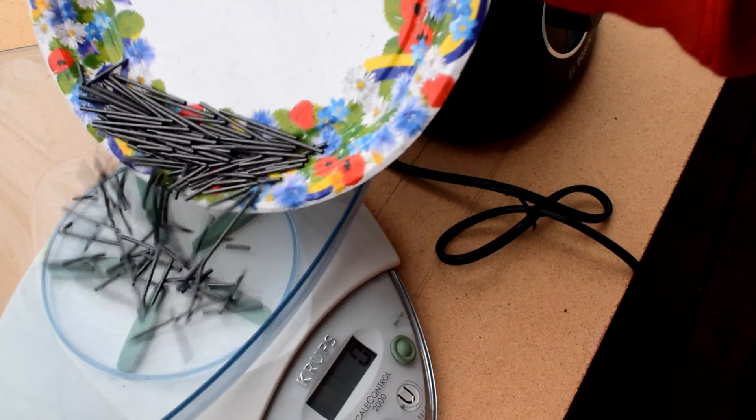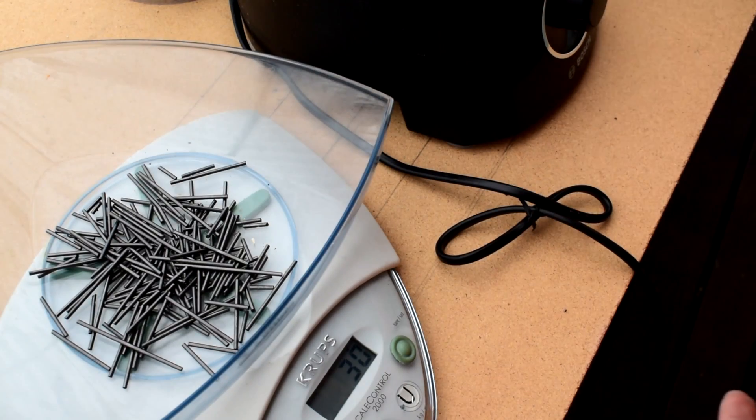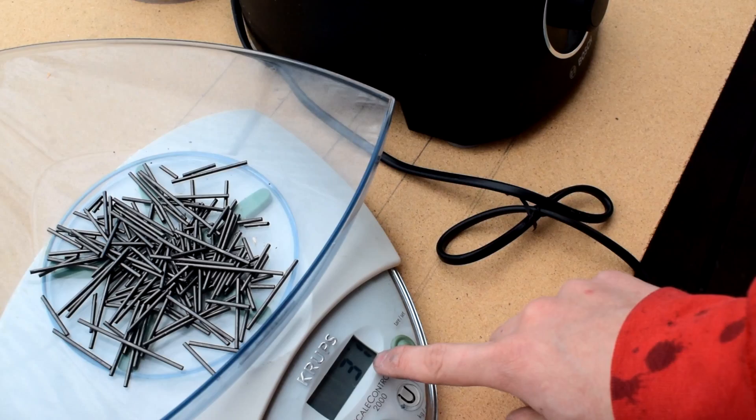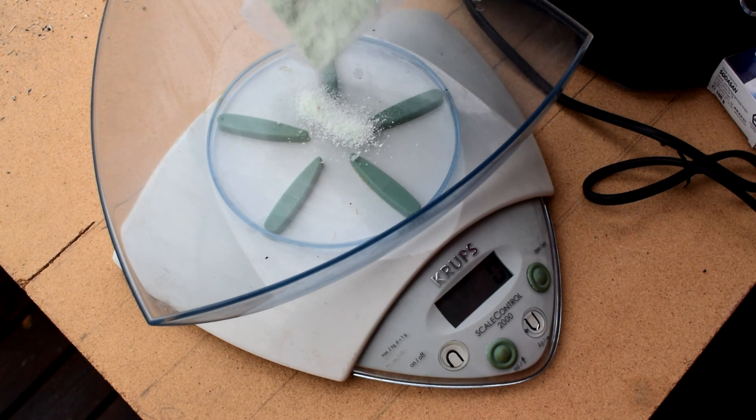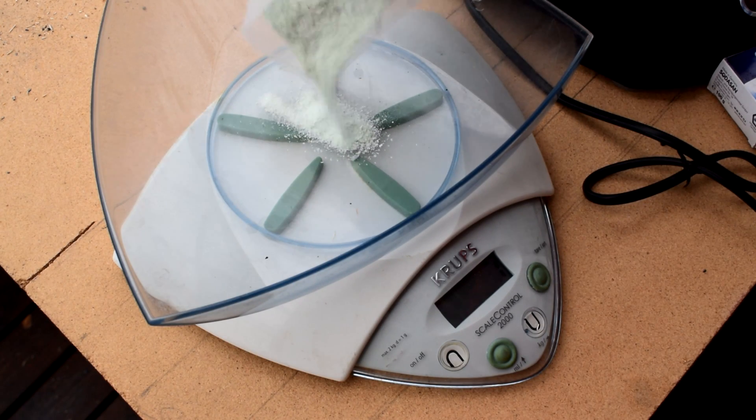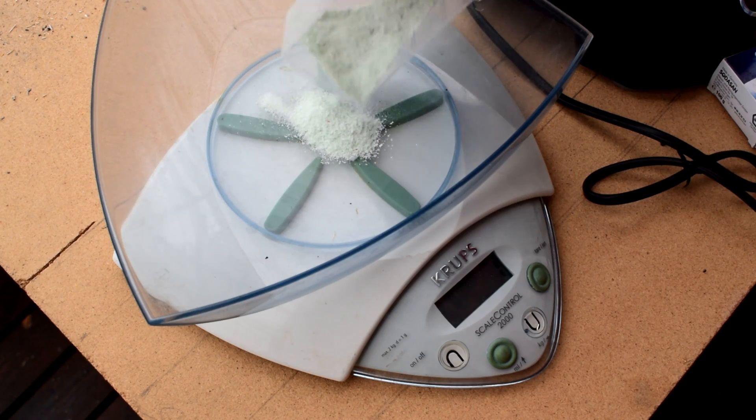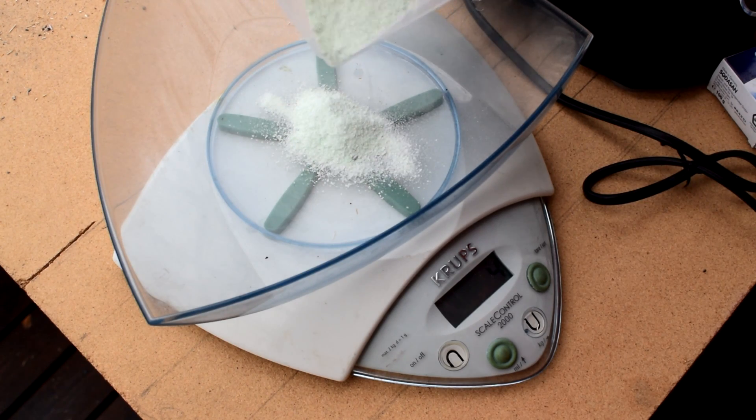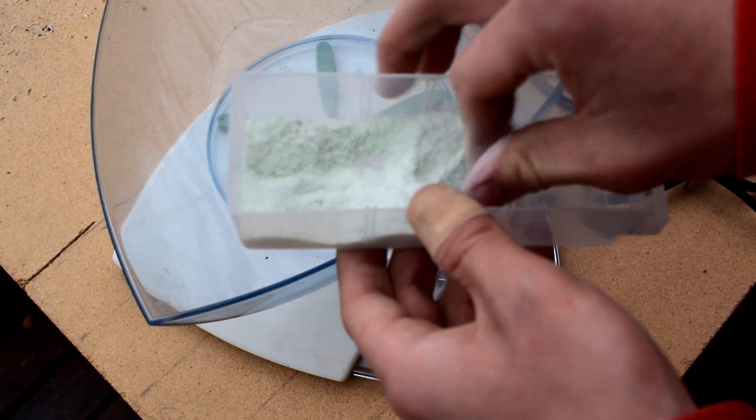After extracting all graphite, measure them. I have about 31 grams. The ratio is one part gall soap to eight parts graphite. So 31 grams divided by eight is a little less than four grams of gall soap. This is just some I've ground it down.